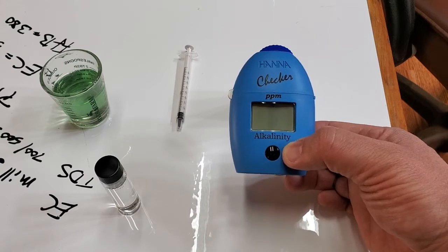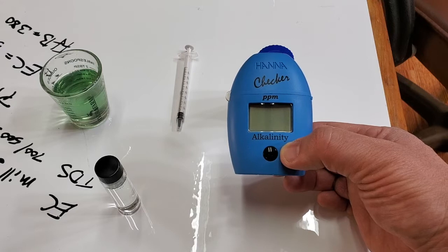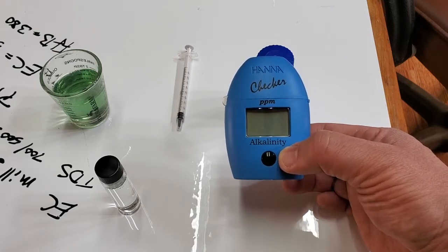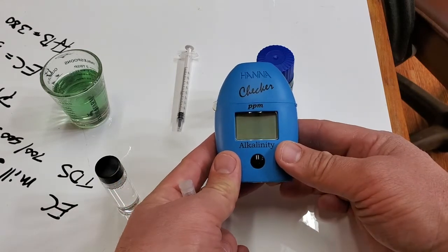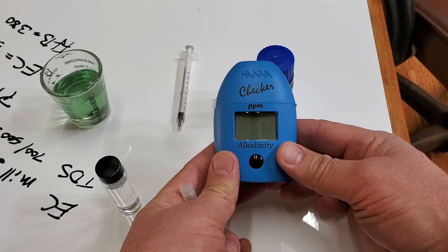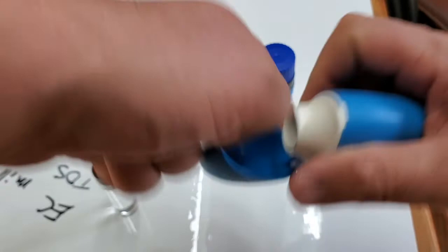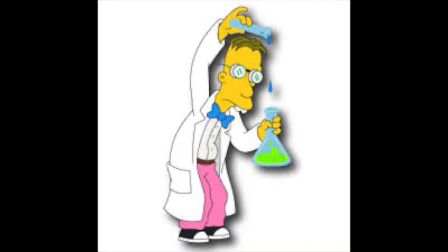If you don't have any alkalinity, it's going to strip nutrients, calcium, and carbonate out of the water you're trying to feed your plants. If it's too hard, it's going to be really hard to buffer the pH and you'll need additional filtration. It's also good for checking if your RO filters are blown out. And it's got this fun little science kit kind of vibe.